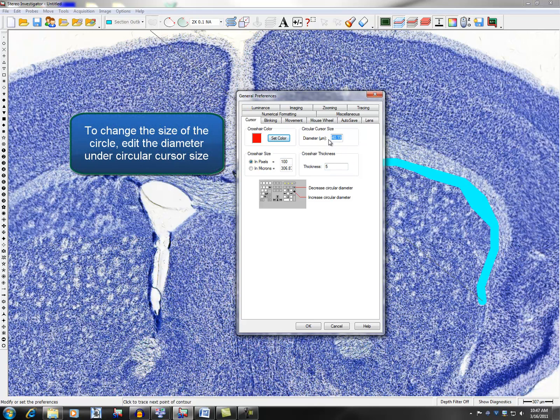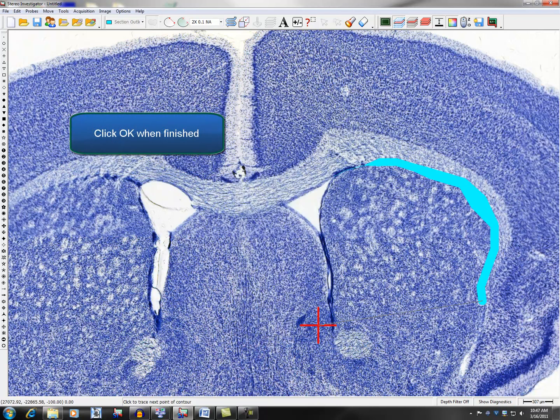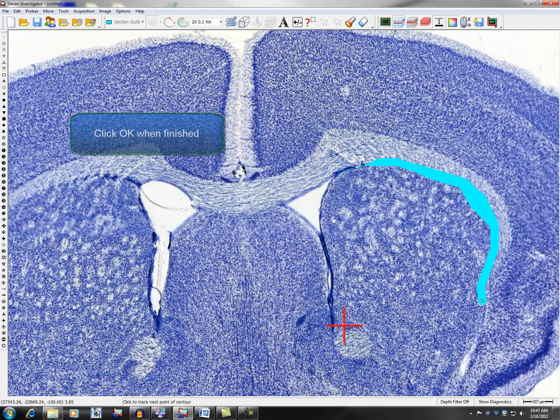To change the size of the circle, edit the diameter under Circular Cursor Size. Click OK when finished.